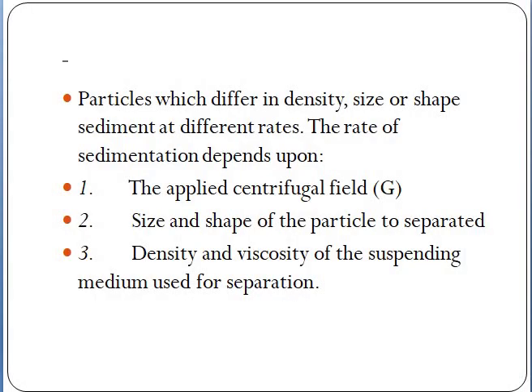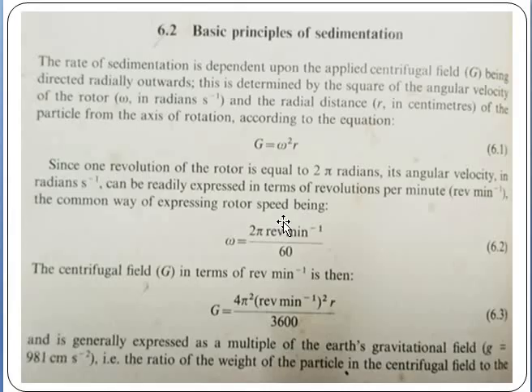When we look at the basic principle involved in this separation technique, the first one is the applied centrifugal force. The second one is the size and shape of the particle we are going to separate, and the third one is the density and viscosity of the medium we are using for suspending the particle for separation. Now, under this, the first one is the applied centrifugal force.